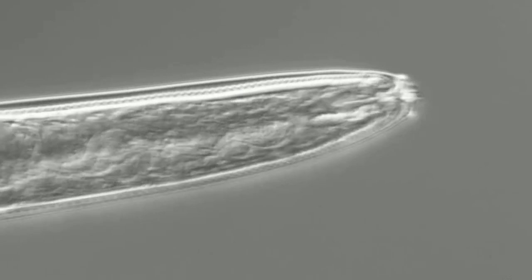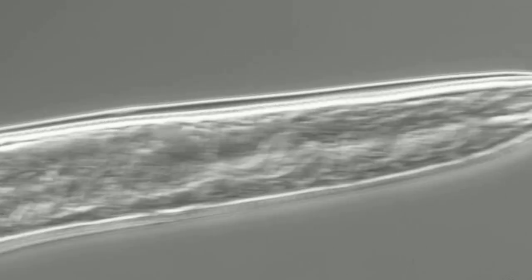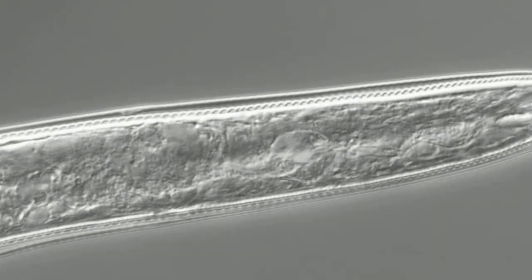As we move towards the posterior side of this nematode, we can see part of the pharyngeal region in focus. This pharyngeal region has a metacorpus median bulb.